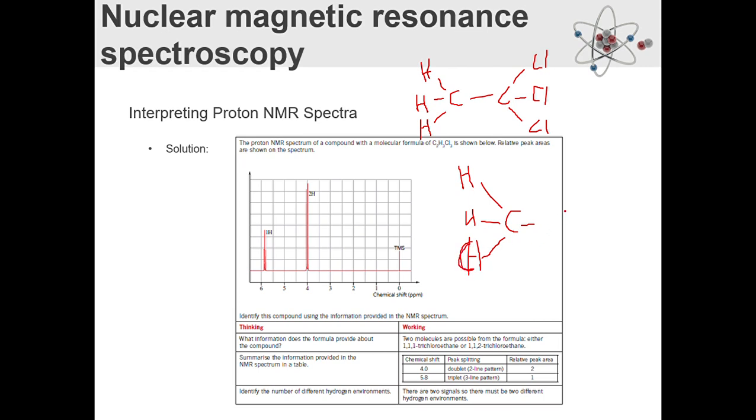It's the worst Cl you've ever seen, but it's fine. Cl, and H. Alright, now, we have 2 different peaks. One has an integration value of 1 hydrogen, and the other one has an integration value of 2 hydrogens.